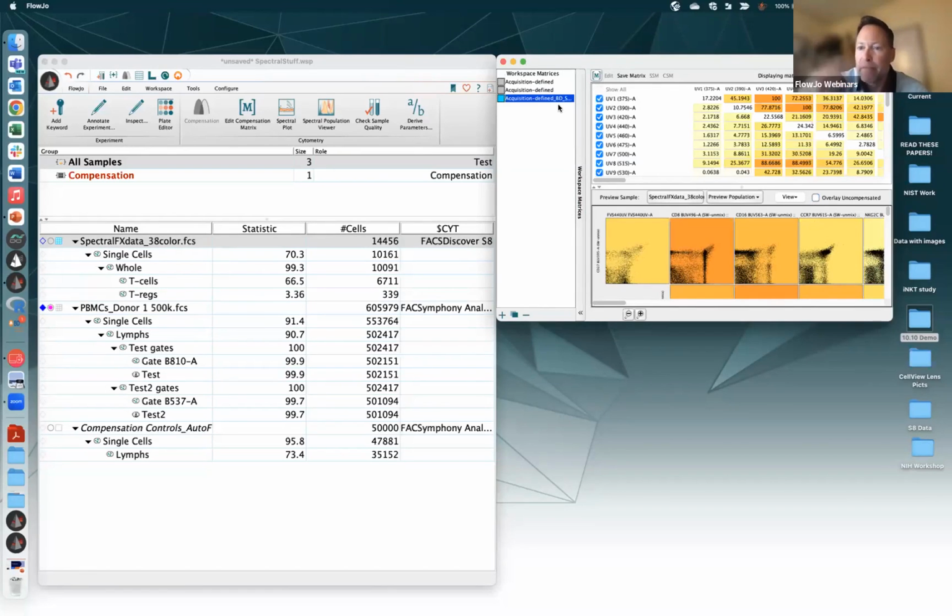And that is going to then, after it's done thinking, and it might already be done, have used the SpectralFX keywords to create an unmixing that again is reflective of the characteristics of the detectors on the instrument as it was when you collected the data. So it's pretty custom to each time that you run it. That's just a nice way to do it.